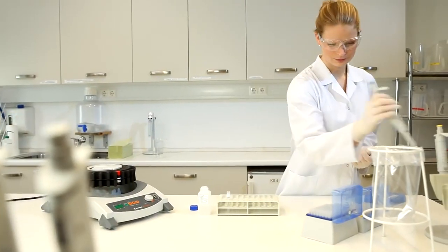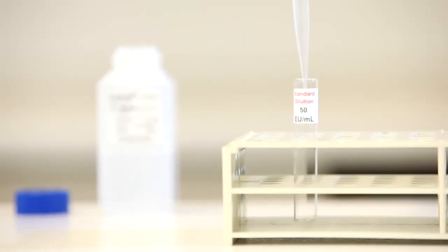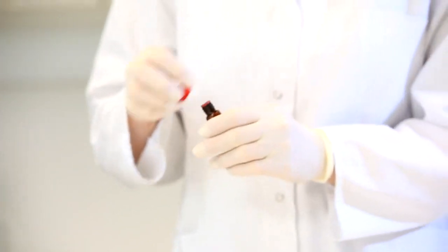For the dilution series, pipette 900 microliters of endotoxin free water into each test tube. Be sure to use endotoxin free glassware for all standard dilutions and samples. Avoid using plastics.